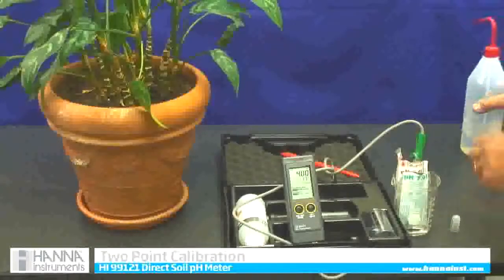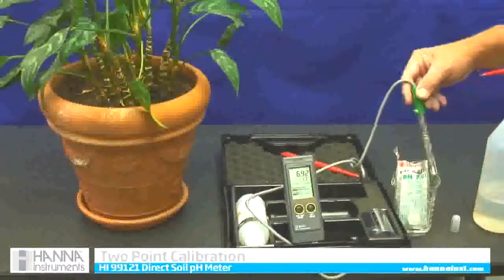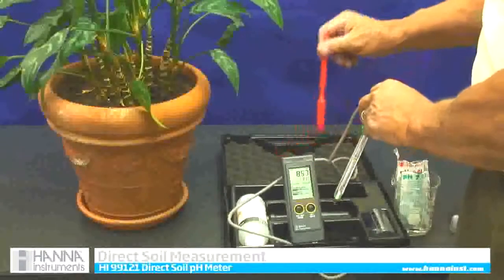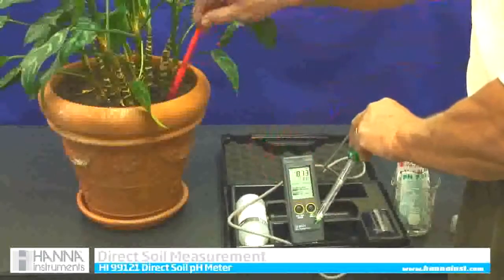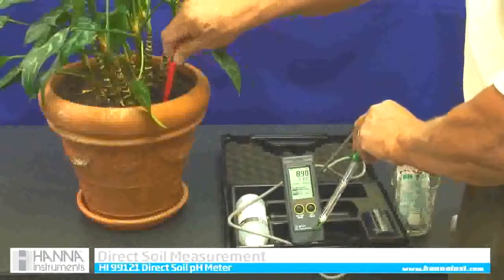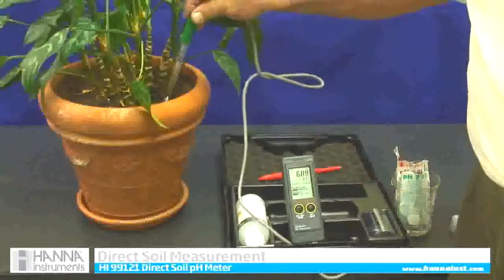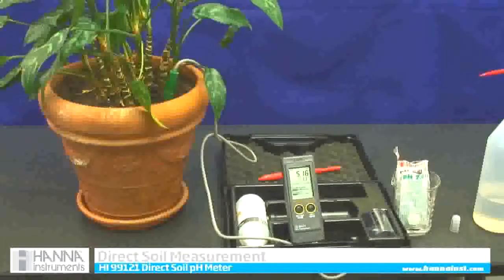I am going to rinse it off with a little bit of clean water. Now to take a soil pH reading, we have this lovely house plant — it has been in the office. Because my probe is fragile, I am going to use the little doubler stick that comes in the kit to make a pre-drilled hole, and then just insert my meter into that hole. Whatever the green tip is touching will read. My reading is 5.18, so close to 5.2 pH.